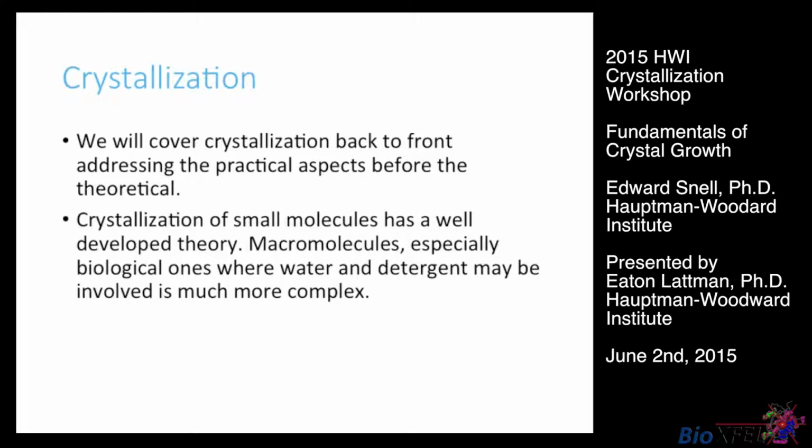I'm going to talk about some of the practical aspects of crystallization and look at some of the different kinds of experiments. Crystallization of small molecules was studied long before proteins, and there's a lot of theory about it. There are often two-component systems, water and something.